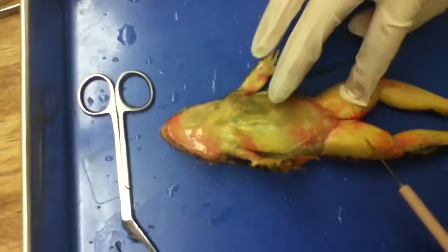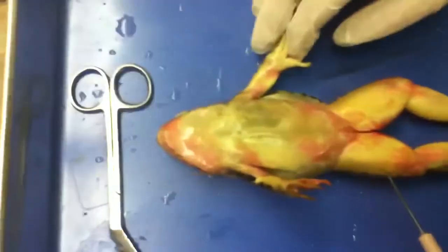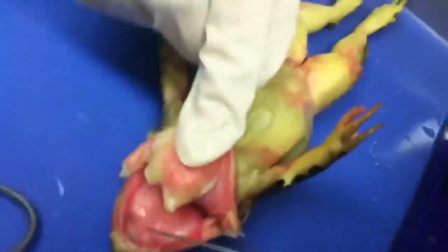Check off the following structures as you find and identify them. Okay, find the vomerine teeth. They're right here, the little teeth. There are two right here. You see them? Yep, they're right here. They're so tiny. Yep, and they're uneven too.